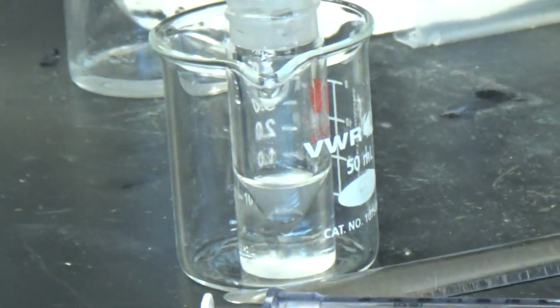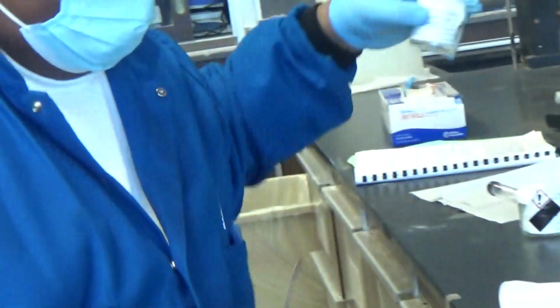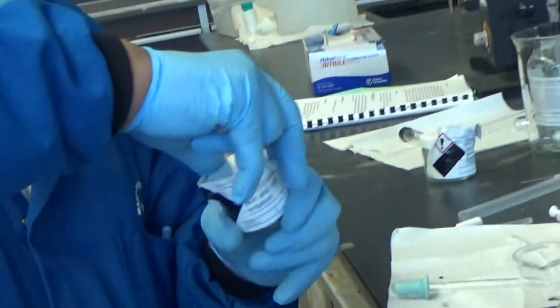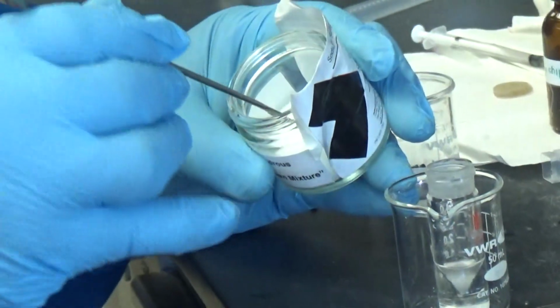So we go back here, and what we do is add some drying agent. You're using sodium sulfate anhydrous, Na2SO4? Another white solid. That's going to absorb the water at the bottom.